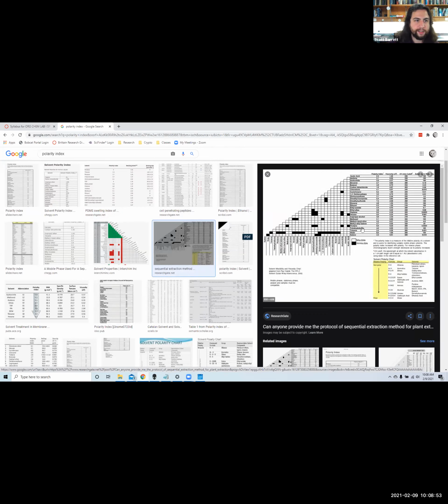I love this chart personally. If you're a chemist, it's very useful. You can actually look at it and figure out which 2 solvents are miscible together. So this is really nice for if you're in lab and you're trying to make a mixture to create a polarity. So you have your polarity index, right? And you have something like benzene 2.7 and you have pentane at 0. Well, what if you don't want to have only 2.7 or 0? What if you want to have somewhere in the middle, like 1.7?